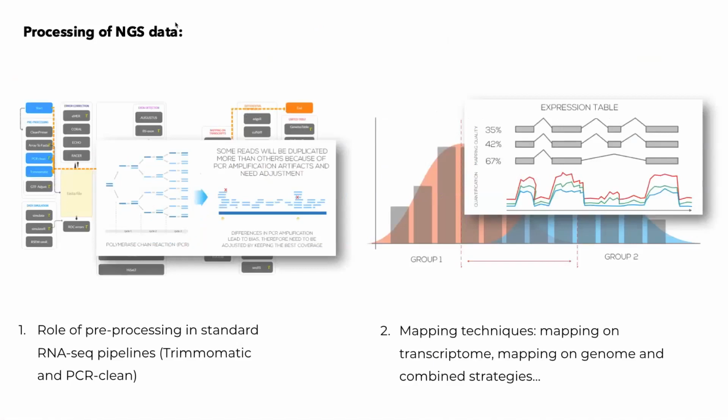Thank you. So today we want to talk about processing of next generation sequencing data. And we want to talk about it in two ways. The first is the role of pre-processing.